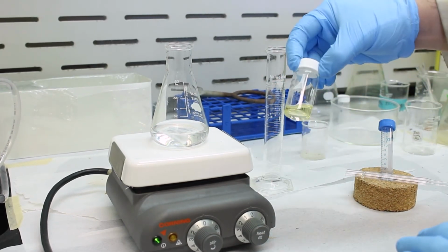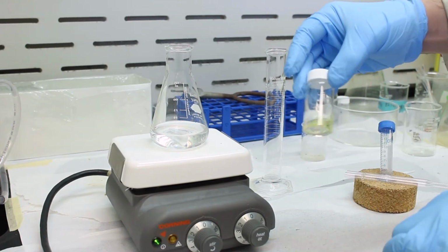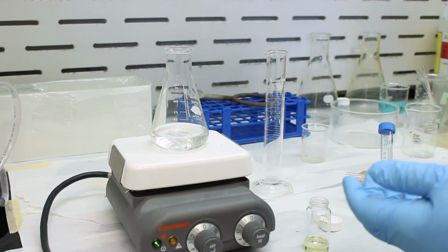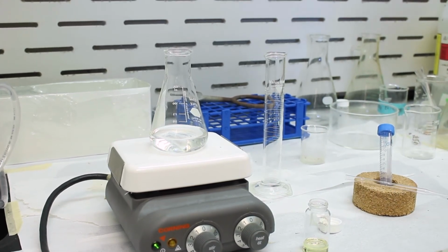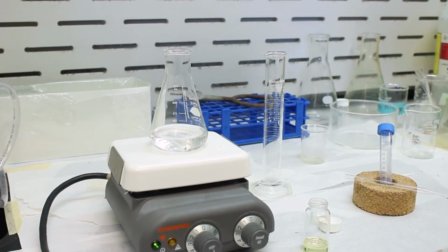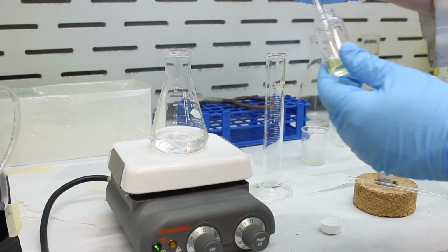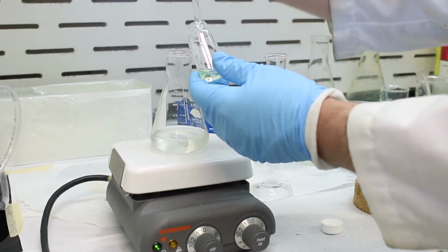Okay, here is our p-anisaldehyde. You can see it's a light yellow, and we're going to be using about 4 grams. The exact amount will be given on Canvas. And typically when you perform this in lab, you would use a smaller scale, but we're going to try doing a bit of a larger scale for the recrystallization. It might work better. So no fuss here. We're just going to add the p-anisaldehyde.